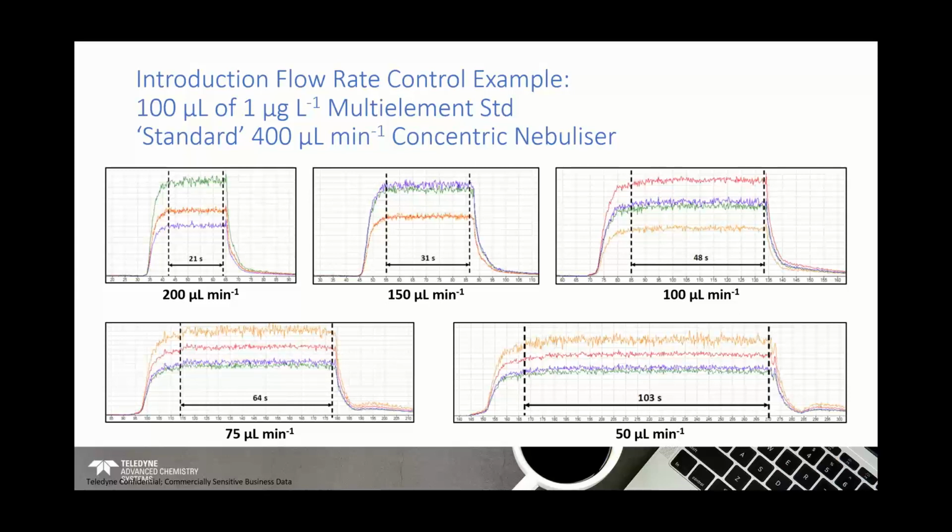Now, of course, if you stretch that out, something's got to give. You do give on the sensitivity, so your sensitivity might come down a little. But you've got the ability to work with this, and with most modern ICPMS instrumentation and the kind of sensitivity that's available from those instruments, that allows us to really make the most of the sample.